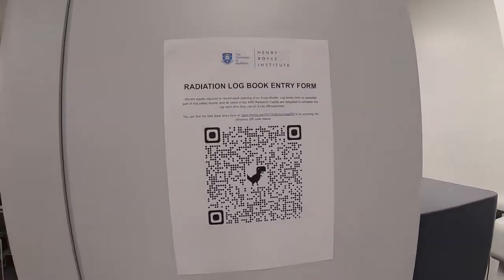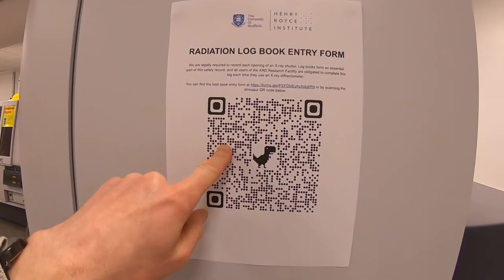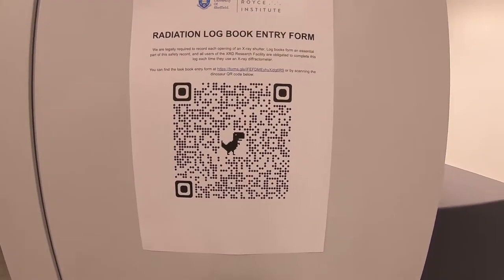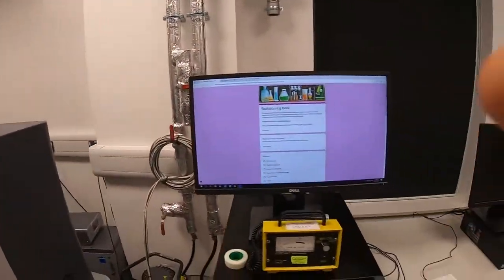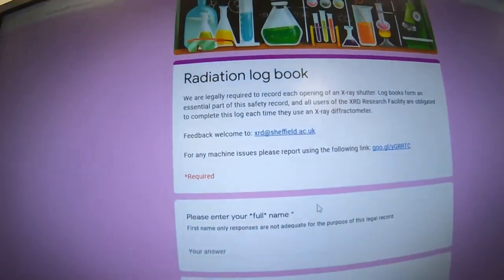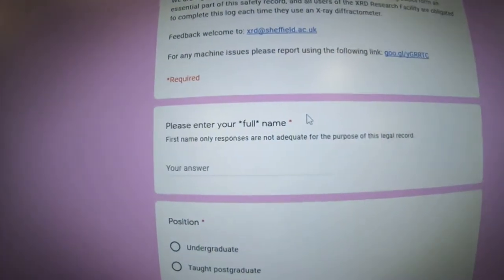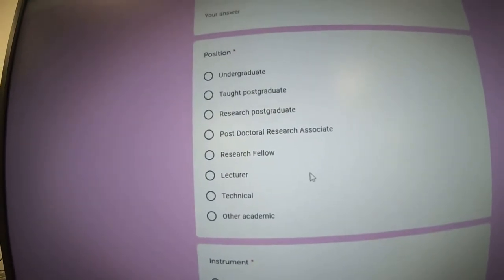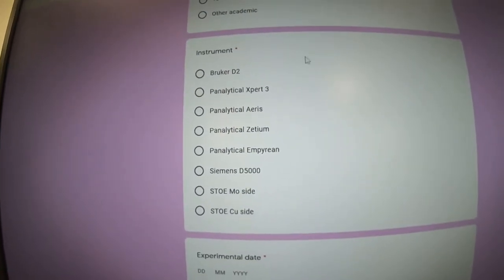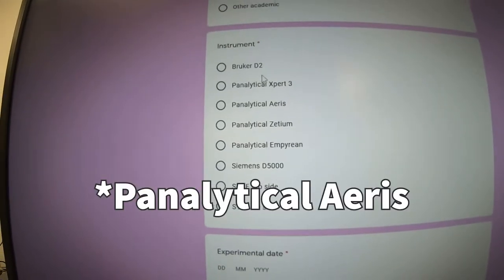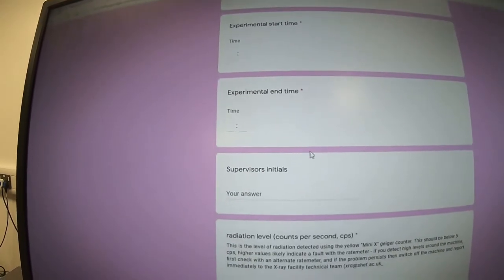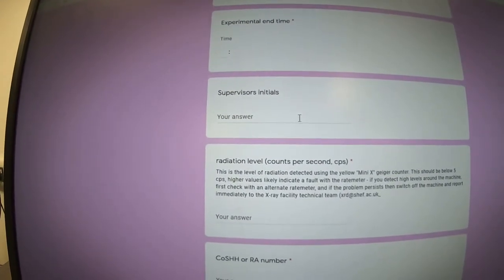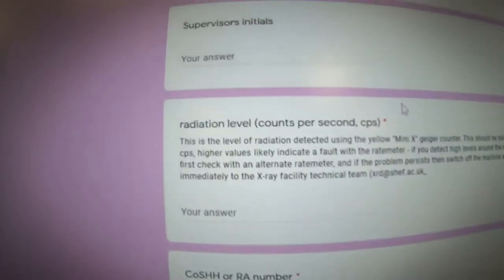Now we're happy that we're not exceeding any radiation limits inside the lab. We need to go and scan this with our phone and we will be able to fill in the logbook. Hi, Rob from the future here. Now to record the radiation level, there's lots of these posters with this QR code around the lab. All you have to do is visit this site here or scan this code in and you'll be directed to a form. Here is the form. First it requires you to fill in your full name, then your position in the department, then it'll ask you what instrument you're using, so you're using the Brooker D2. After that we have information on the date and time of your experiment, your supervisor's initials if you have a supervisor, and finally the count per second.